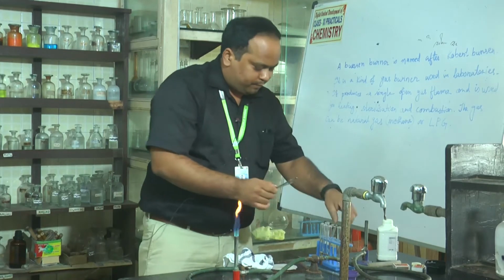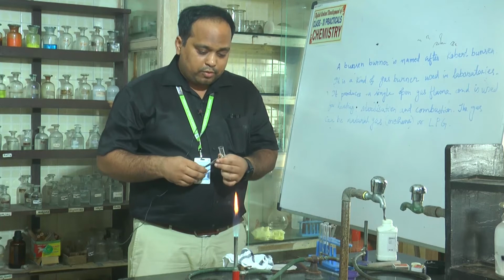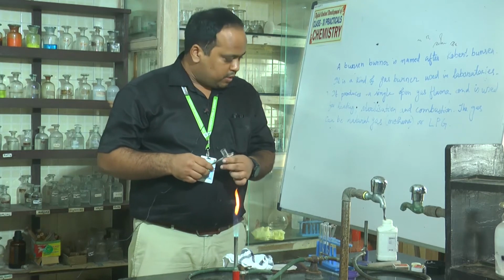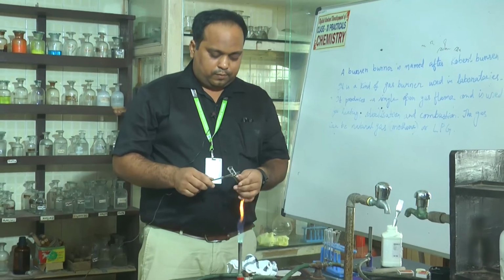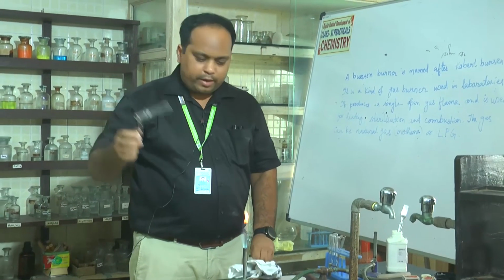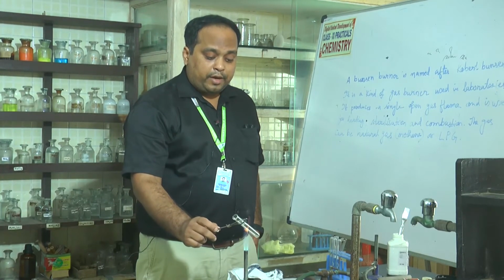Next I am heating. So next we will go for another salt. Okay, again take another test tube. Dry the test tube. Make it dry.